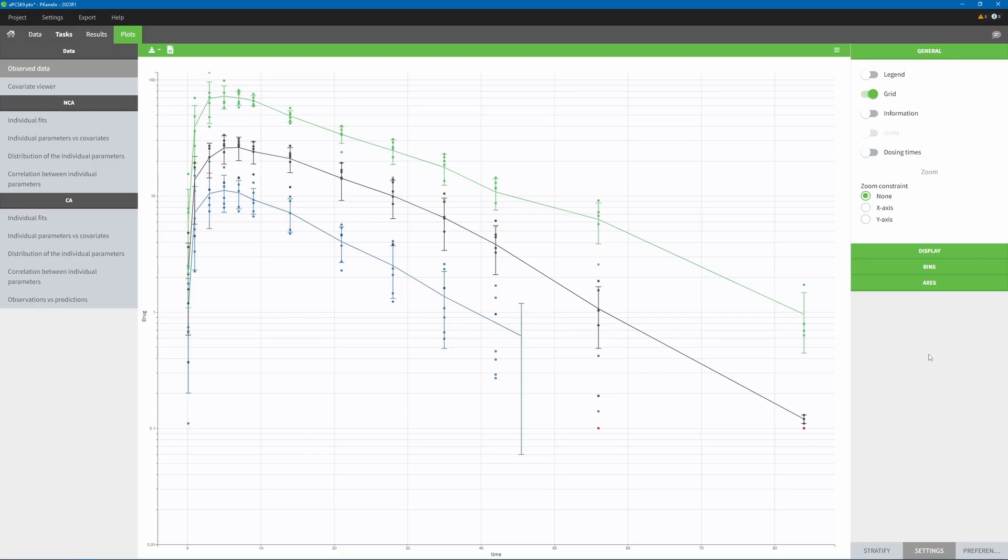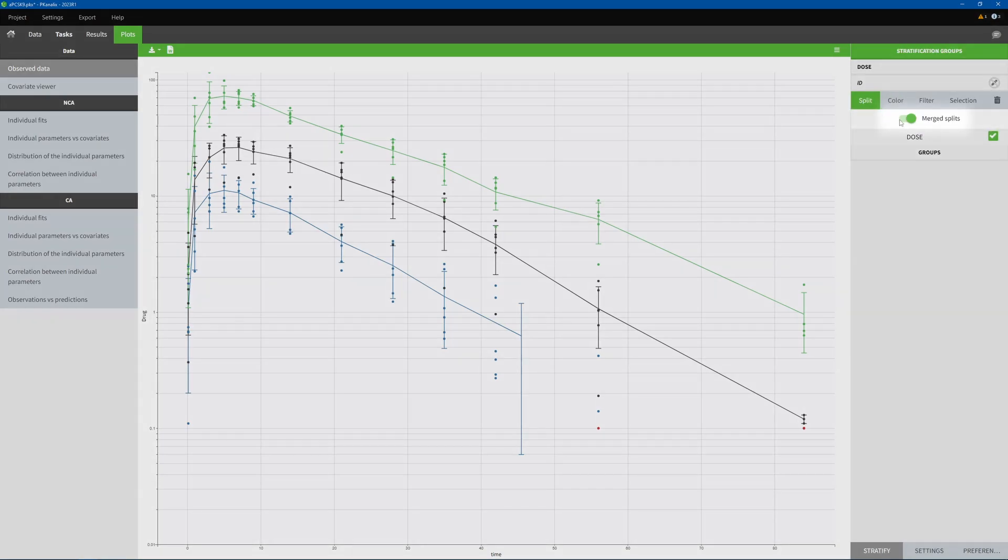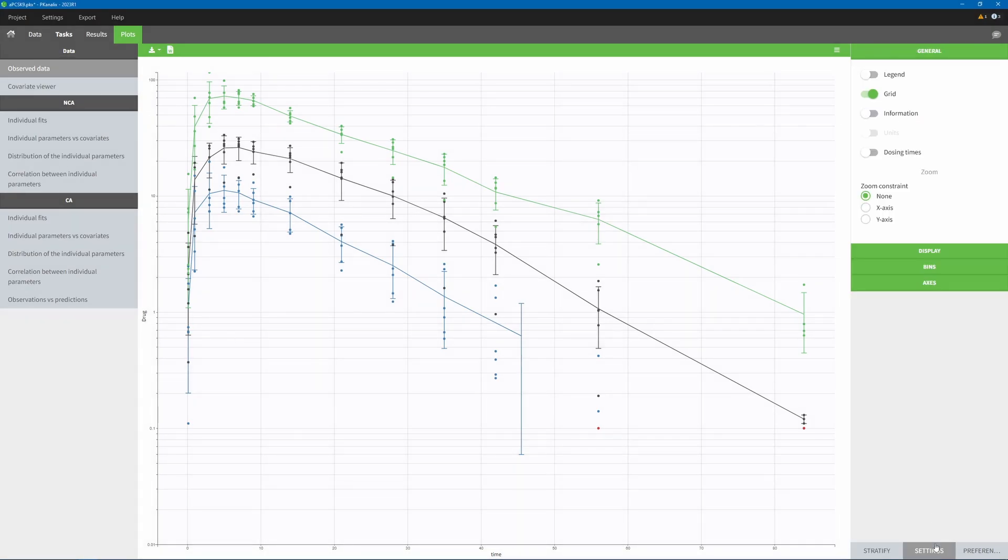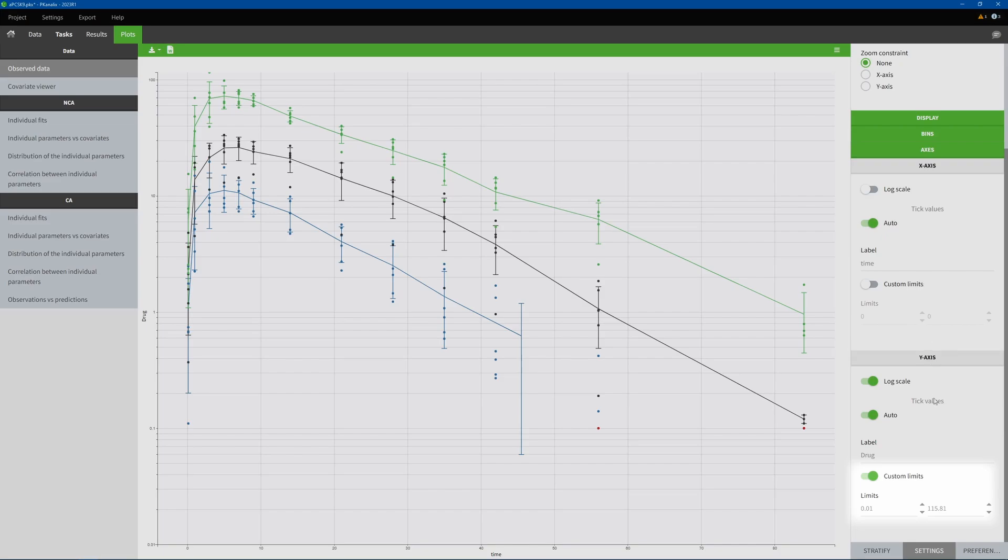To generate the plots in this report, I also took advantage of the new capabilities of PKanalix 2023. In the observed data, I can now overlay statistics for different groups on the same plot thanks to the merge button. And on this same plot, I can now select custom axis limits, for example, here I set a lower limit of 0.01.